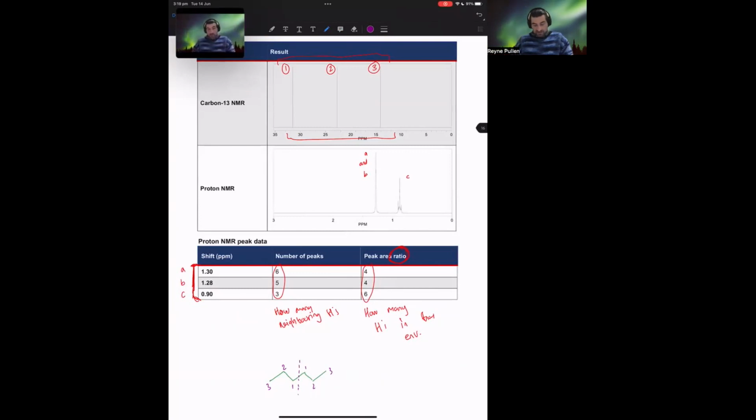These really close peaks, 1.3 and 1.28, they're super close because they likely, maybe I'll use a dark blue here, they're likely going to correspond with A and B. Because when you think about the de-shielding that occurs, once again, I'm not sure how much depth you've gone into this, but the idea of de-shielding these zones, and therefore the more de-shielded they are, the more they move down in their shift. These will be very similar to one another. There's no factors that really differentiate them.